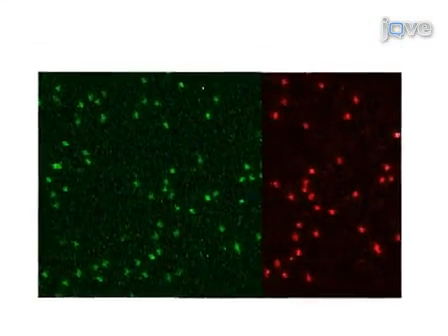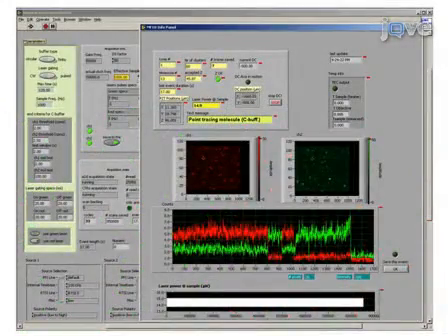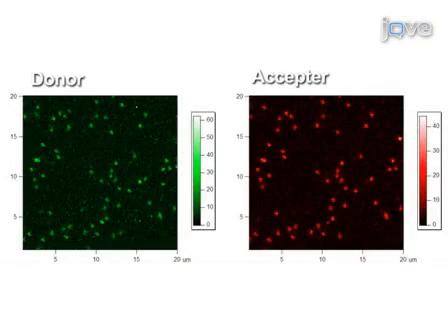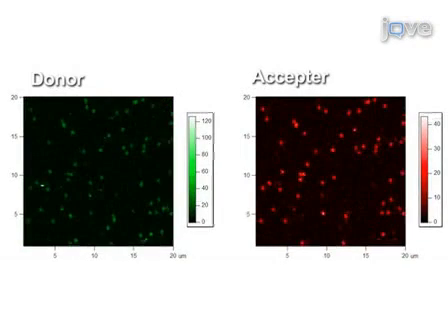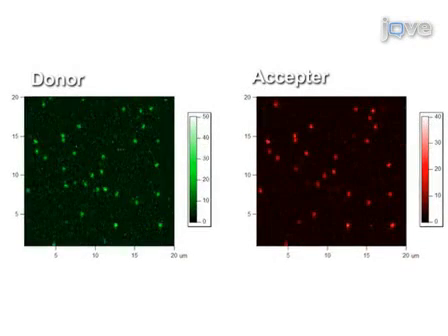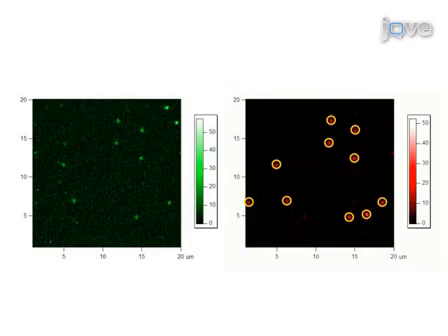The surface scanning, molecule localization, and acquisition of single molecule intensity traces is controlled by the LabVIEW program, which scans 20 by 20 micrometer squared areas at 0.2 micrometer resolution with a rate of 0.1 micrometer per millisecond. The data from the surface scanning is immediately processed to yield the intensity-weighted locations of all pixels above the background counts.